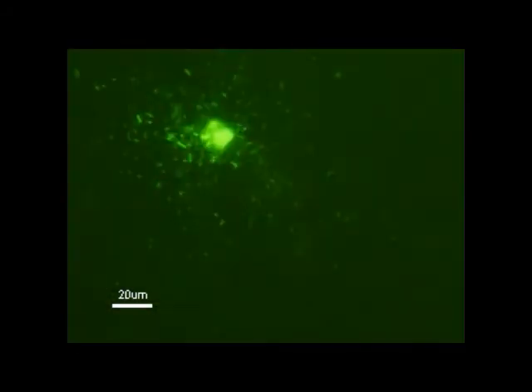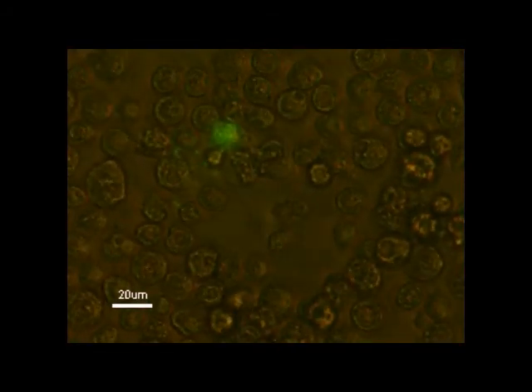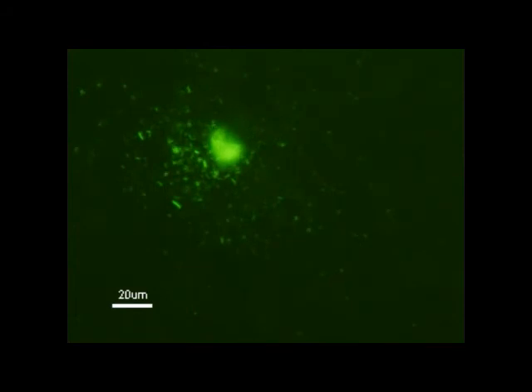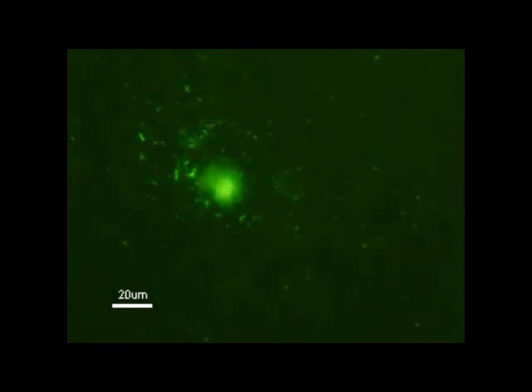And we've switched the light source so that you can see the amoeba host cells in the background and the lysed bacteria from the amoeba that has been overwhelmed by the infection. You see how the bacteria have moved out.